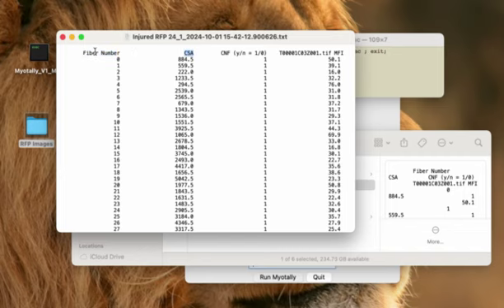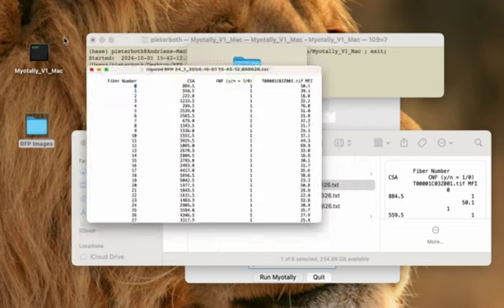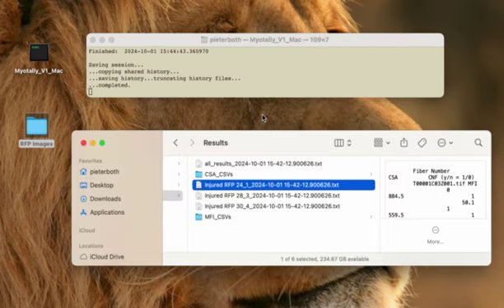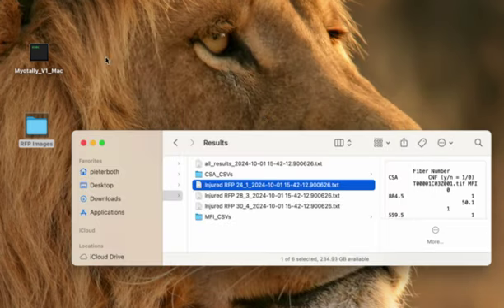Each muscle fiber number has a corresponding cross-sectional area and a centrally nucleated fiber status. 1 or 0 corresponds to yes or no for centralized nuclei. And there's also a column for the mean fluorescence intensity that corresponds to that fiber. See, our software has already finished processing those 3 folders, so it doesn't take long at all.